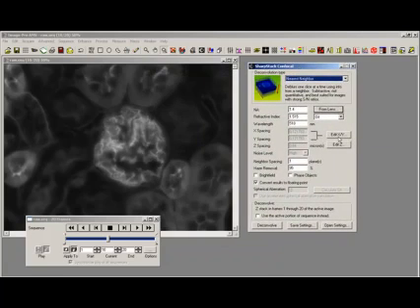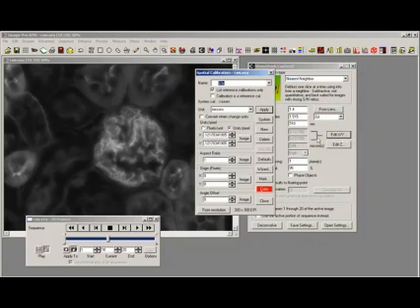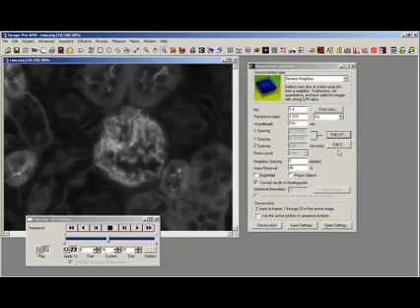We've also got the XY spacing. This comes from the calibration file, but we can edit this if we need to and just put in the data we have. And we can edit the Z distance as well. Everything else remains pretty normal, and I just press deconvolve.